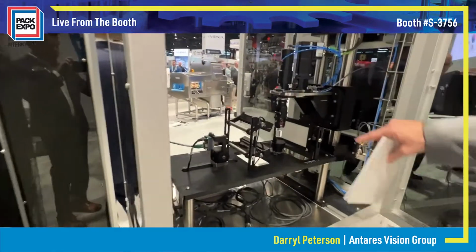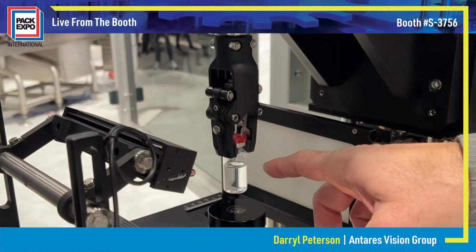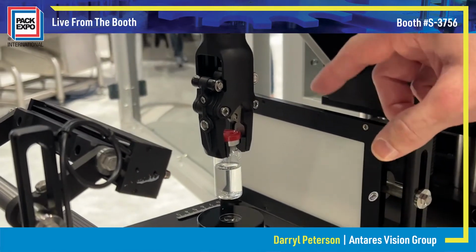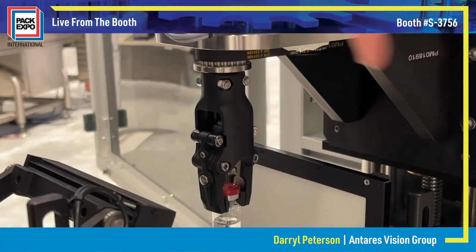As you look here, you will see that there is a vial that's being suspended by this device here. This vial has liquid product inside. It's a standard 10 ml vial, and we're holding it here with this gripper mechanism. This gripper mechanism also has a torque motor on it, which allows it to spin.